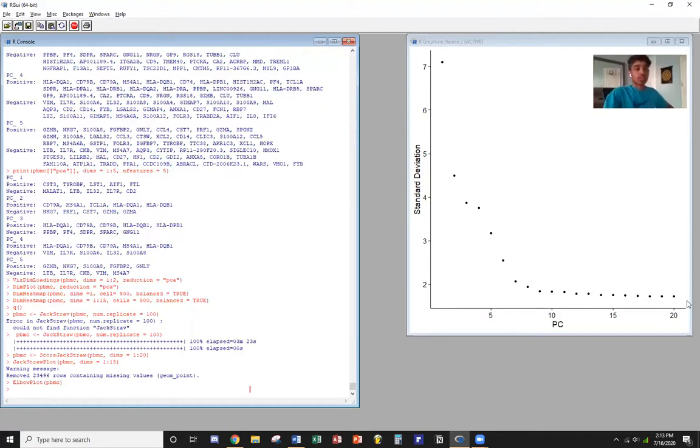And so, yeah, the first line of code, the initial JackStraw one, will always take a while, so you're going to have to wait. Well, I actually put a V in this one. That was the error here. So we're okay.